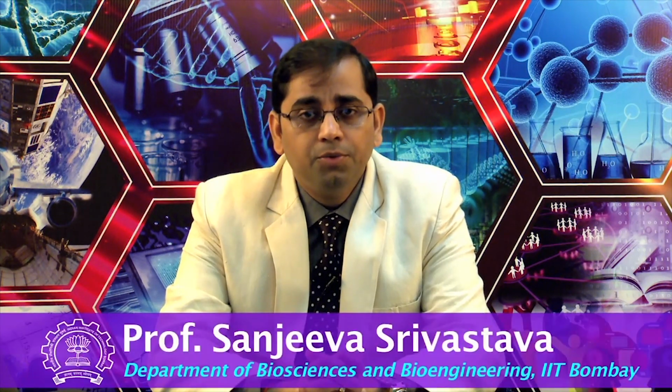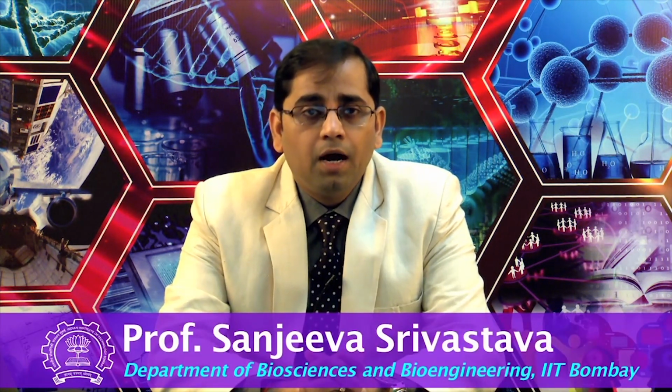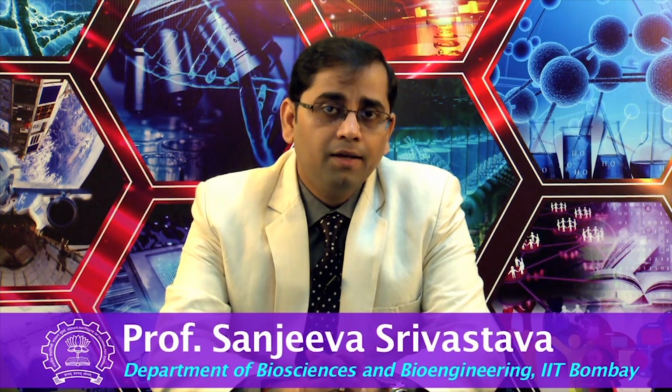I hope in this lecture you have learnt about inkjet printing and its benefits. You are also taught about different kinds of substrates which are used for this printing and the advantage of this technology over other technologies. In the next lecture, Dr. Saloni will continue and talk to you about how exactly this technology works and how it can be used for many microarray based applications. Thank you.